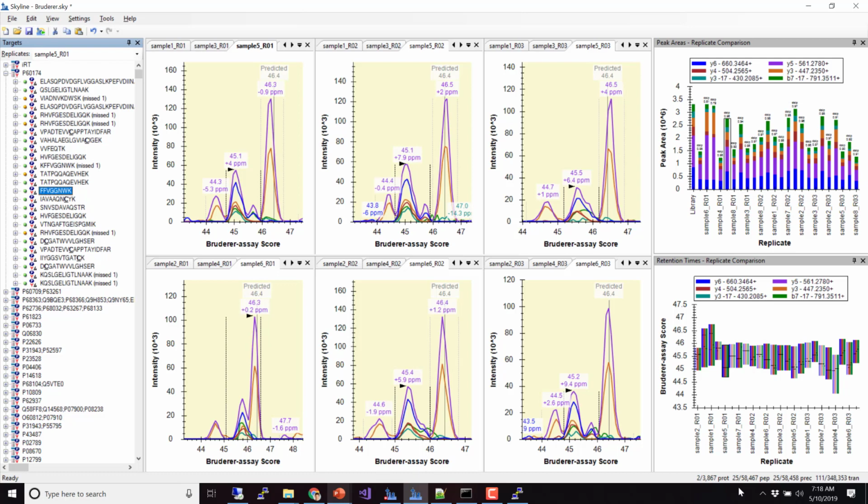So you can see, it's easier to see these interferences because you don't get coelution on everything. I've shown you some examples of MS1 precursors where I have to really go, oh, it's the ppm, and you have to come up with explanations. It's really difficult to even notice that it's interference, because so many peptides have the exact same isotopic distribution, and the MZs match exactly.